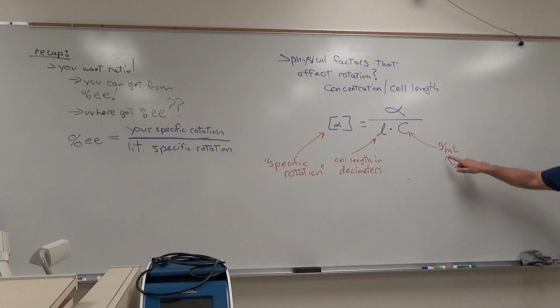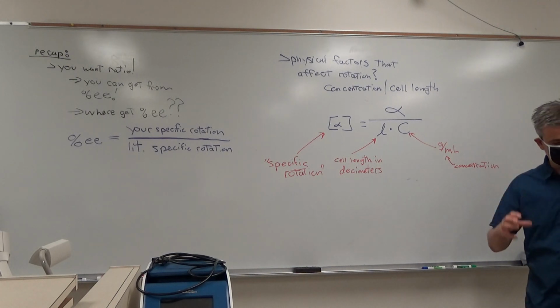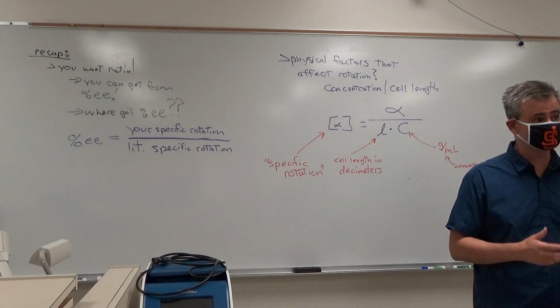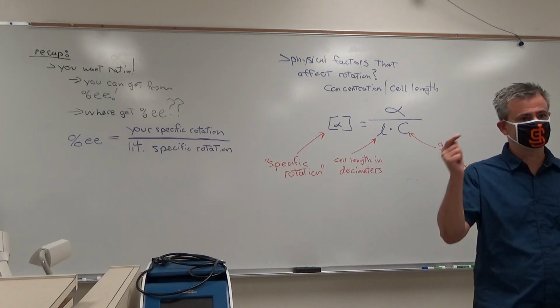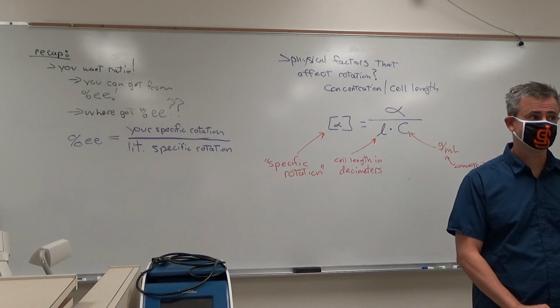You can't put 200 milligrams, or 0.2 grams, in this equation because not all of those 200 milligrams are your product. Don't worry. We have to figure out what percent of that mass of my 200 milligrams is ethyl 2-hydroxypropanoate. Does that make sense?